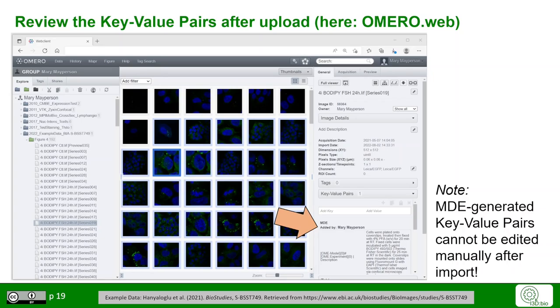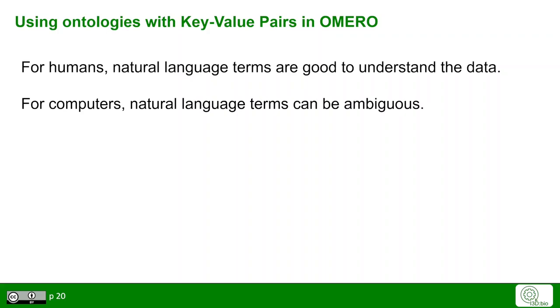Once you have used OMERO MDE, this metadata will also show up under the key-value pairs. Note that key-value pairs added during import cannot be edited manually afterwards — this is a feature to protect essential metadata from being accidentally corrupted in OMERO Web.